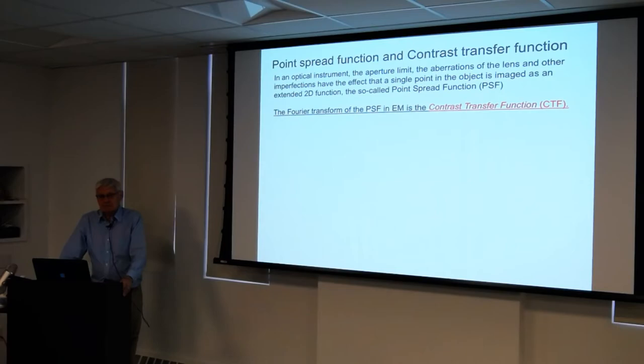So if you took a modular image processing system and took the contrast transfer function, actually mapped it out in 2D, then Fourier transformed it, you would find a very interesting point. And I'm going to show you examples of that.